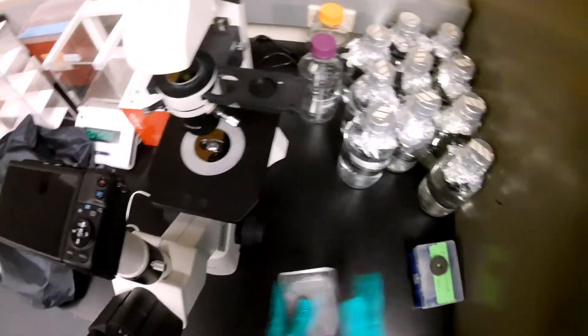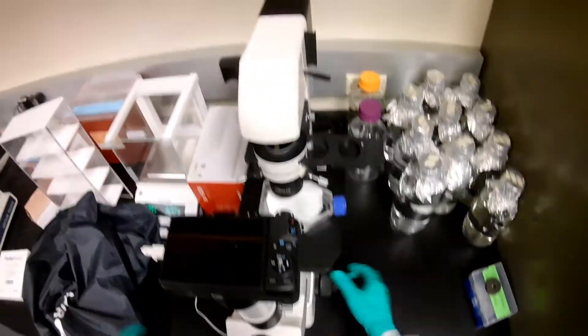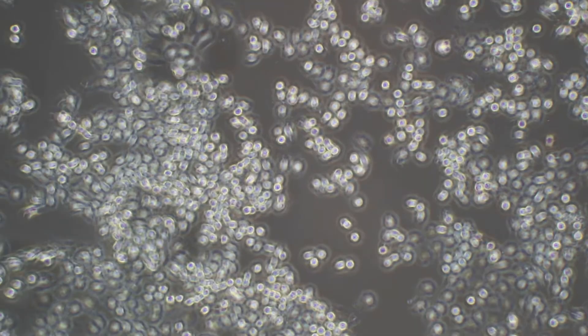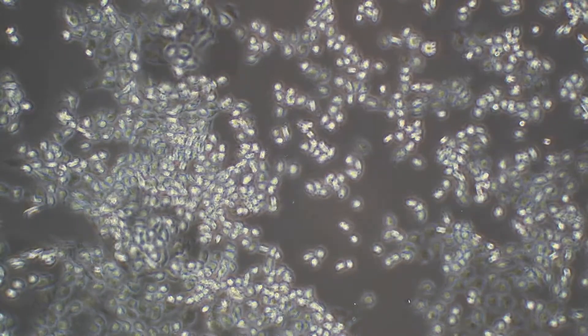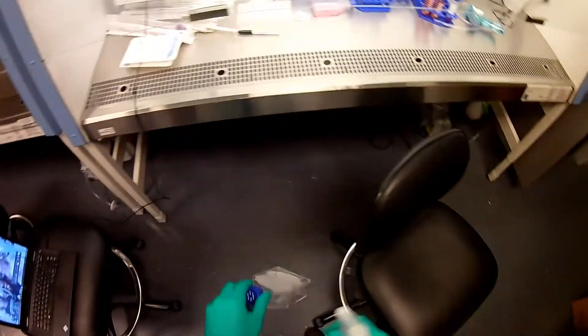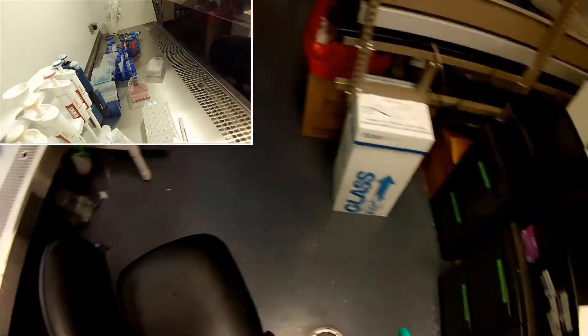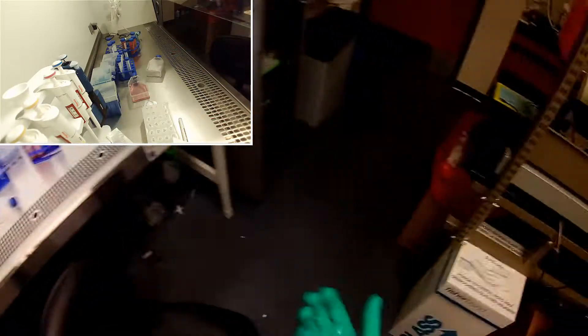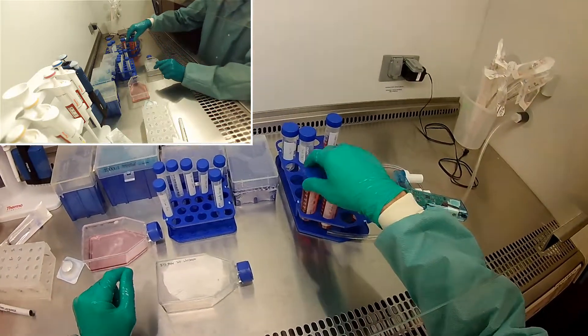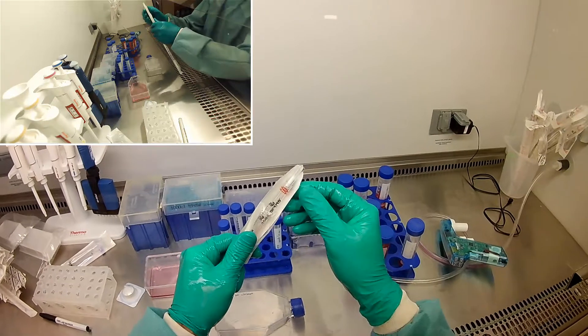I'm going to give them a couple love taps. Let you guys see what it looks like. There's a lot of cells. Looks like there's still some cells attached down there — I might have to tap it a little harder. There we go. Now they've kind of let go and you can see them all floating.